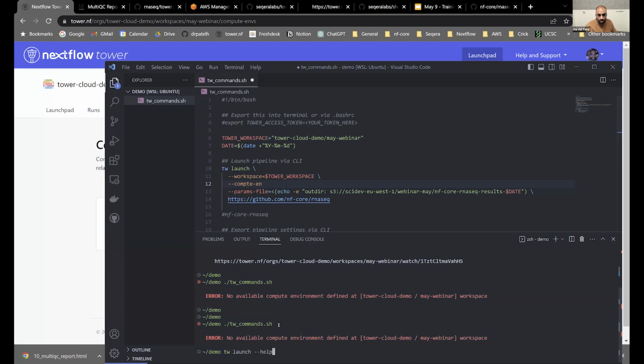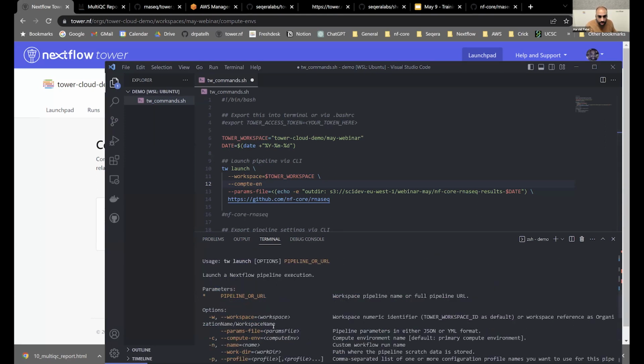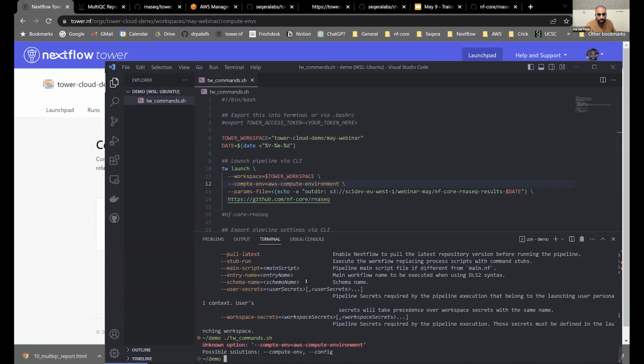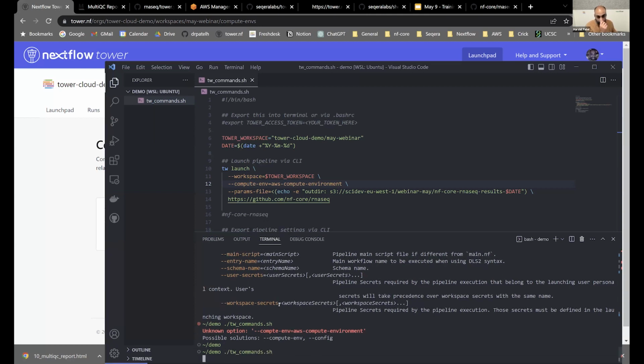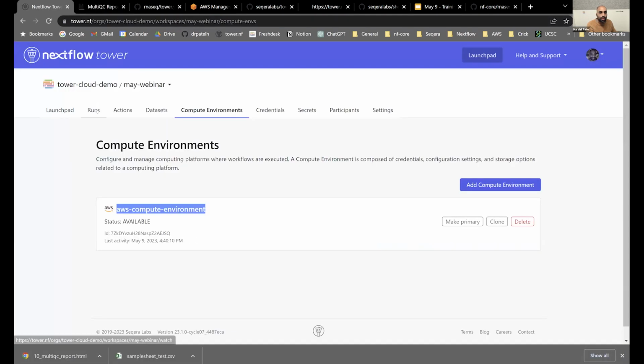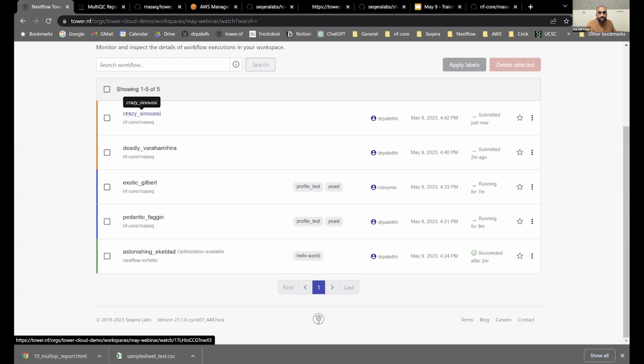So if we look at the help for this, what is it? Is it compute? Let's try now, and I think it should say it wants a revision. Oh, typo. Okay, so by default it will use master, but now I should have 4 pipelines or 5, is it now in total? Yeah, so now this is the one that I've triggered directly from source.